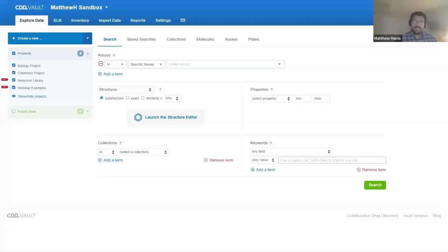Hello, everyone, and welcome to our Q3 quarterly webinar update. My name is Matthew Harris, and I'm a customer engagement scientist here with CDD Vault. Today, I'll be reviewing some of our exciting updates to our macromolecule editor and some of our new registration capabilities surrounding cyclic peptides, antibodies, and antibody-drug conjugates.